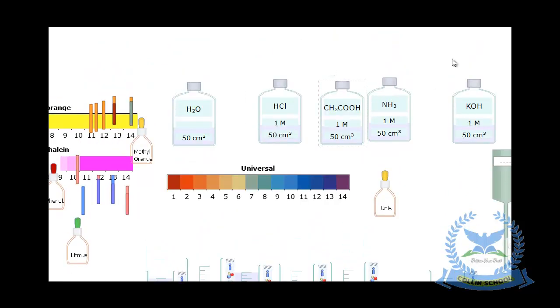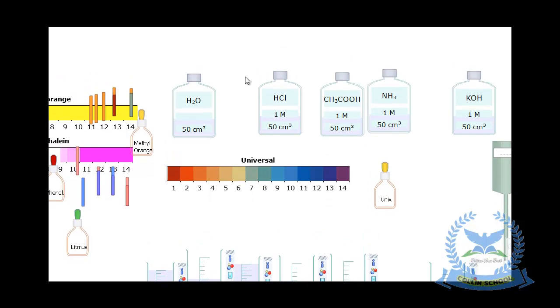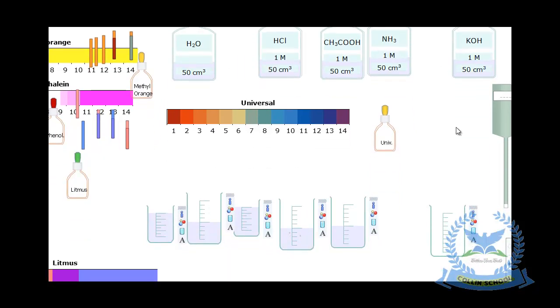Take another. Take this one. Just a moment, I think there's something wrong here. Good. We take another one over here.